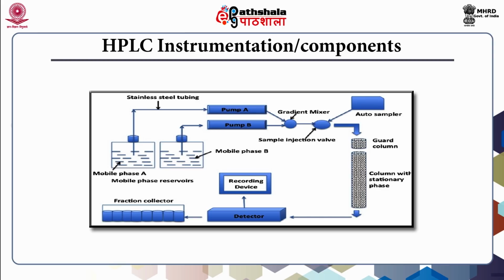Let us discuss all these components of the HPLC instrument one by one. Let us start with the mobile phase.